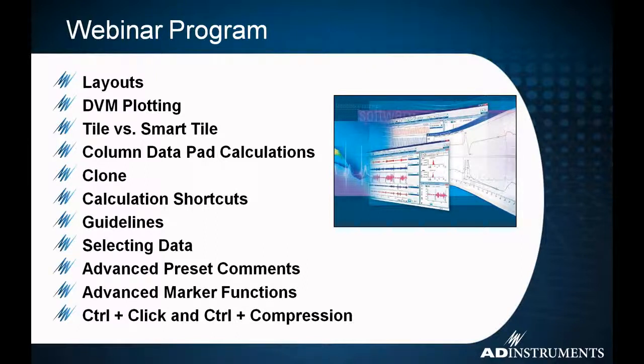This is the table of contents for what I'm going to go through today. One of the struggles that I had in creating this webinar, even though I really wanted to do it because I thought people would want to see the little small features in LabChart that make it nice and advanced in terms of usability, is that you can see a lot of these things are very random.